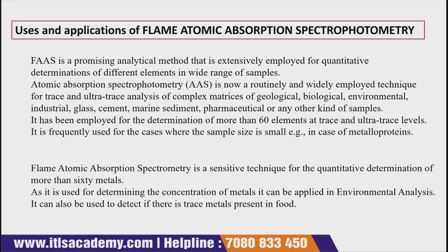So it has a huge demand in the geological field, in biological and environmental fields, and also in marine sediment studies. It has good demand in pharmaceutical and food analysis industries. Because of its low cost and its accuracy, this technique is widely used in different industries.